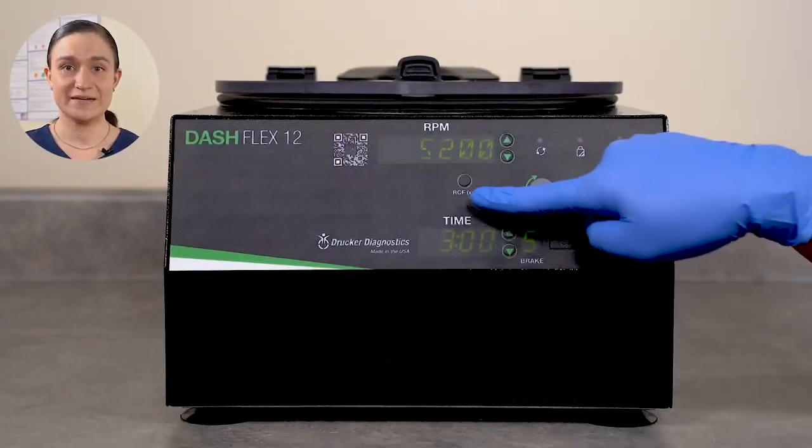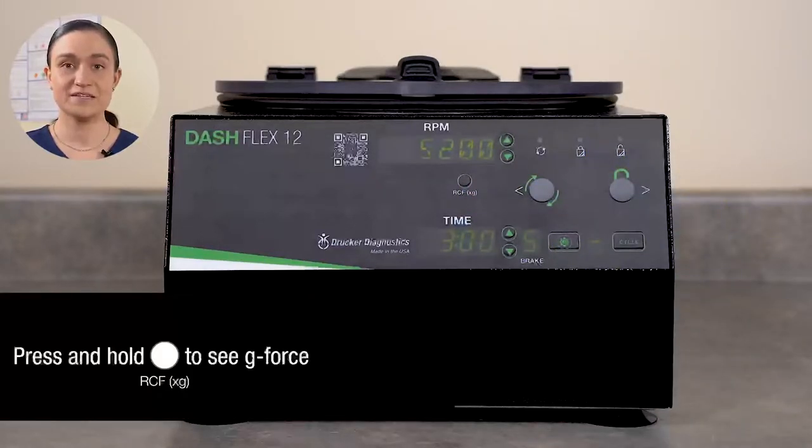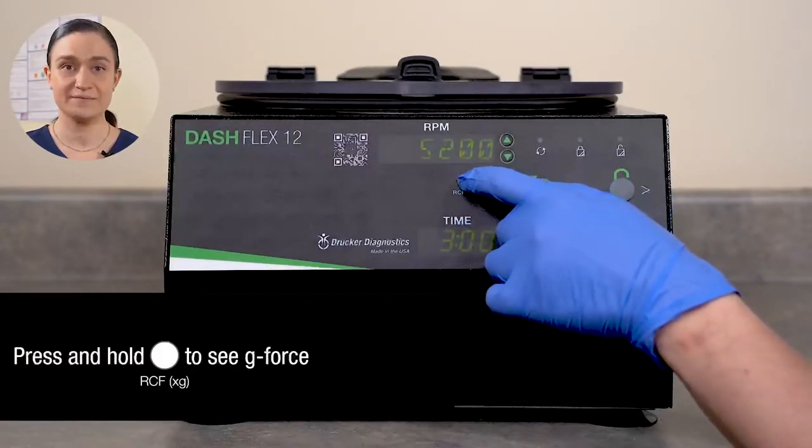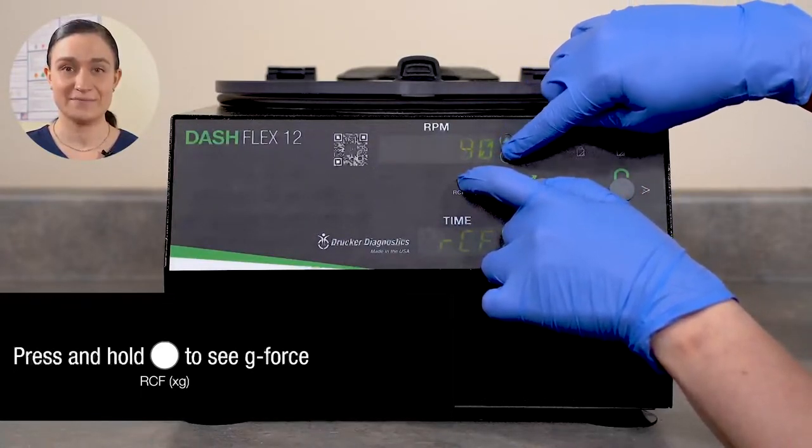The RCF XG button displays the g-force in the RPM window. If you press and hold the RCF XG button, you can adjust by g-force using the buttons next to the RPM display.